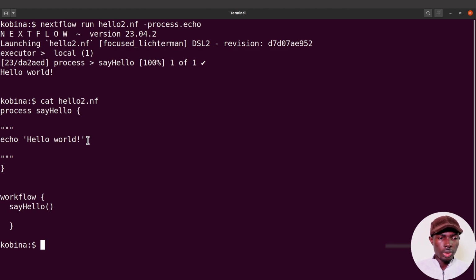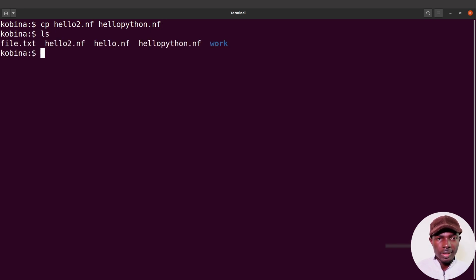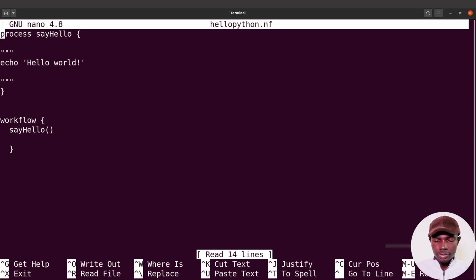Okay, so let's continue. Let's just copy the script. I'll copy the hello2. You can also copy the other one. I'll just say hello python.nf. That's what I'll use. All right, I'll do an ls. So I have that also copied. I am going to edit it and show you how to add that information.